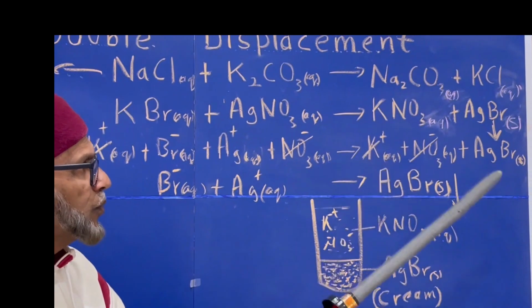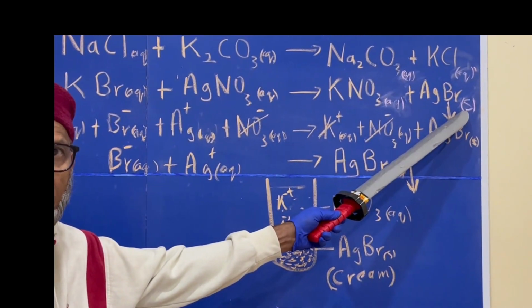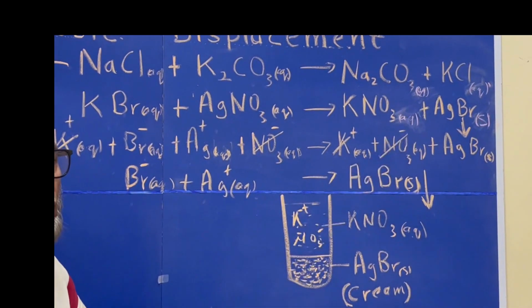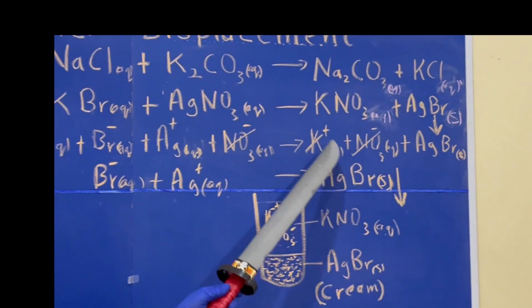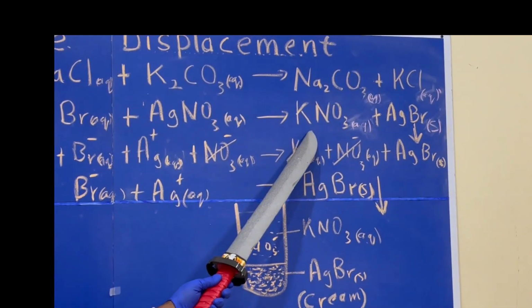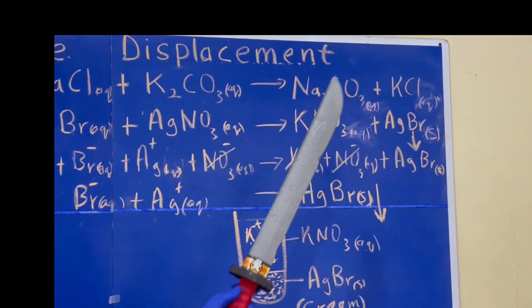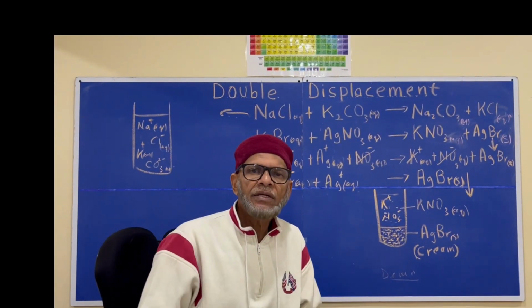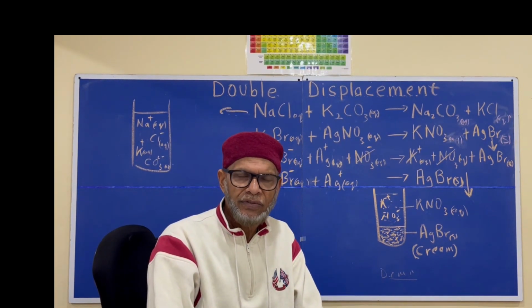If it is found that one of them is sparingly soluble, as in this case, put in S, okay? And then the other one, of course, has to be AQ. Both of them will not be solids. Anytime you have a double displacement happening when you have a precipitate being formed, only one of the products is a solid, the other one is soluble in water. And finally, you'll test your predictions as I have done there just now with these 2 solutions here.